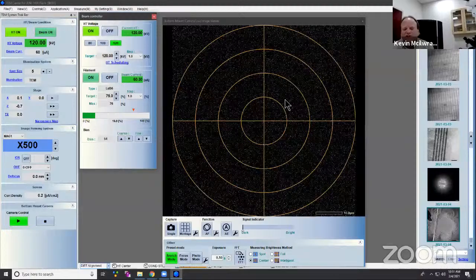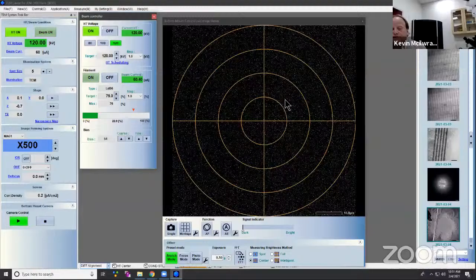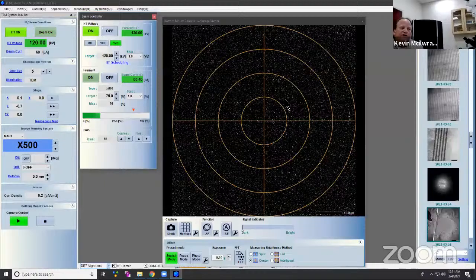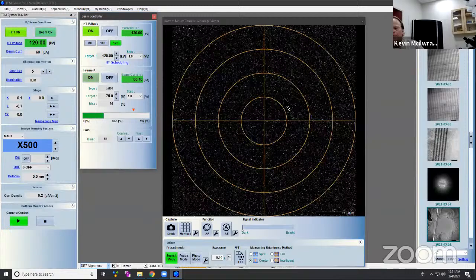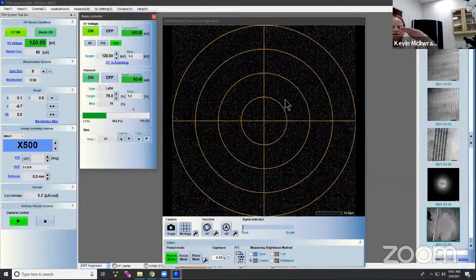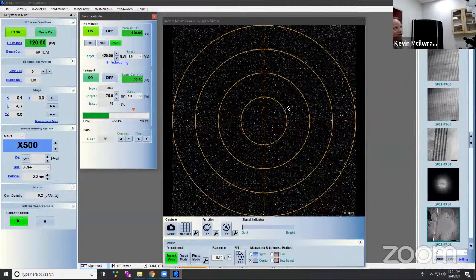Now, what do we do if we have a thick sample? And I mean, I used to have data from a 3 million volt microscope in Osaka, Japan, where they looked at 5 micron thick samples, not 80 nanometers or 50 nanometers. And through that 5 micron sample, they could do tomography because it was a larger volume of sample, right? I mean, in tomography, people used to cut a sample like the SEMs and then image, cut a sample, image, cut a sample, image. Problem doing that is that every time you cut a section, there's compression of your sample. And when you cut through these resins, you have a distortion on each side of the surface, right? So as I cut through each section, I've got to then match up those areas that are distorted so the resolution can suffer. If we use a thicker sample, we have more of a volume and we can actually see clearer, we get more information.